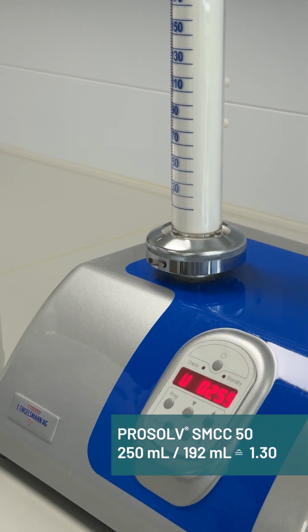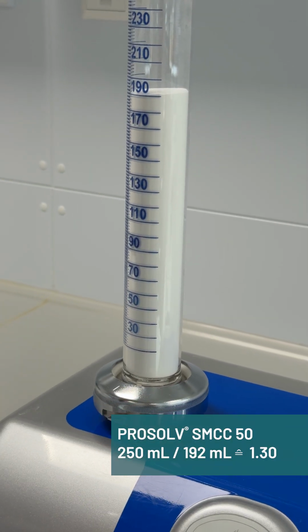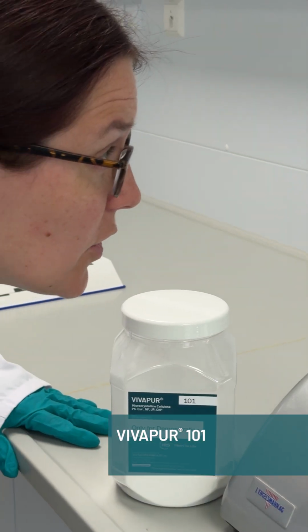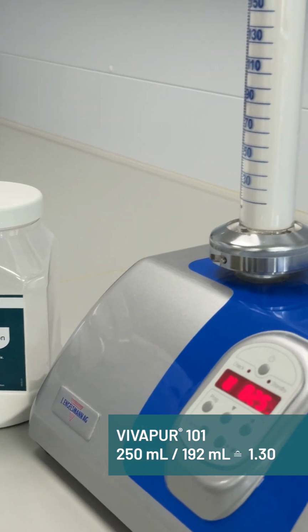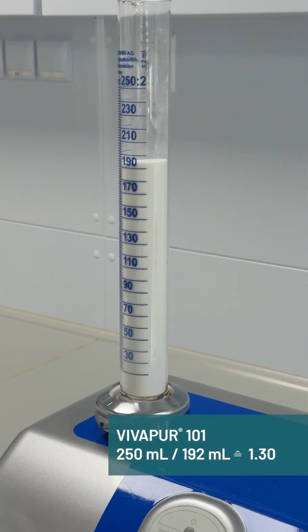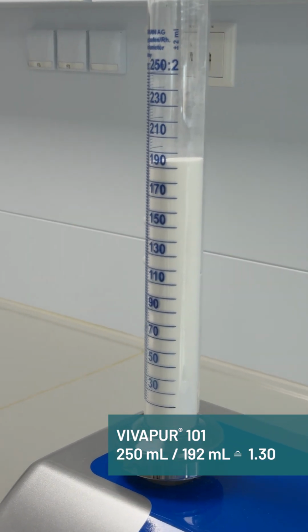192, that gives a Hausner ratio of approximately 1.3, which is passable in terms of flow. And for this material, it looks like the value is about 192 again, which is odd because the flow is actually much worse than the previous material with the same tap density volume reading. So the Hausner ratio is maybe not always the best. It represents some materials flow better than other materials.